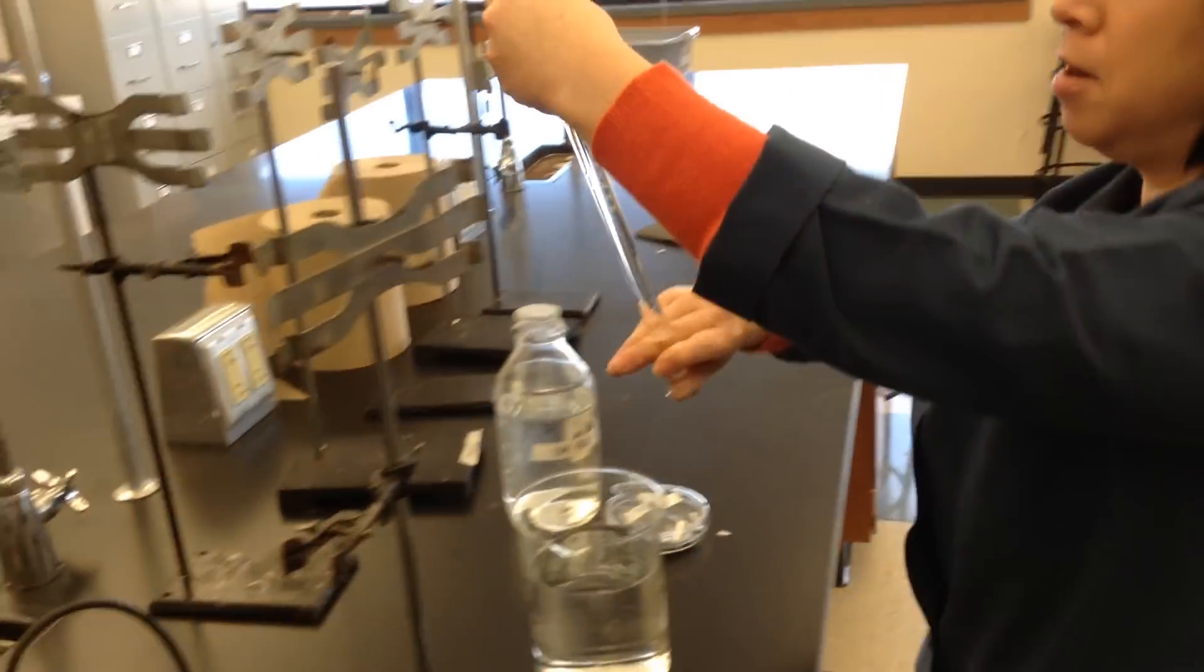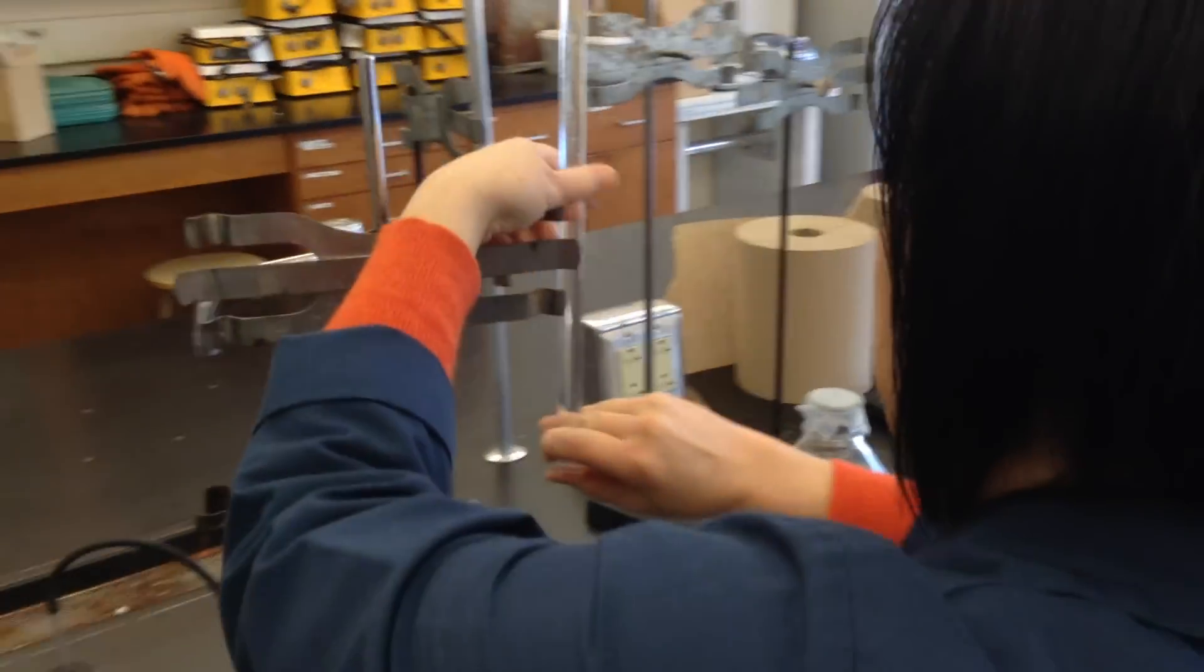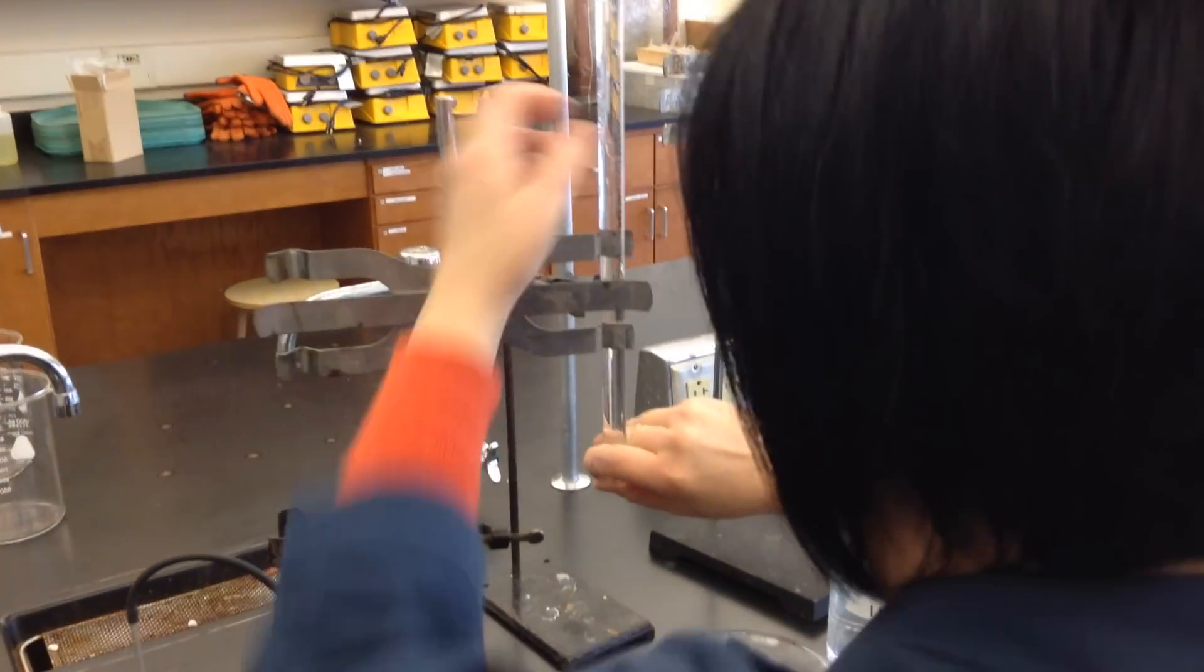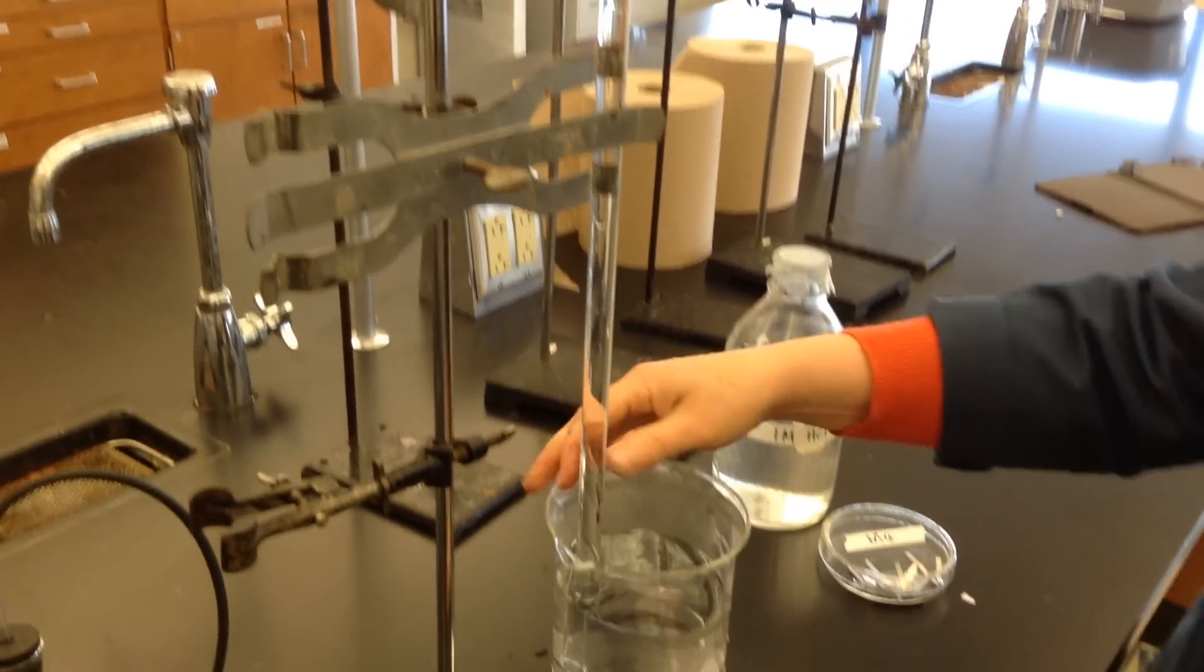You put your thumb over this, upside down, clamp it into place. This is where an octopus lady would come in handy. Keep your thumb on it, put it down in there, and no liquid escapes.